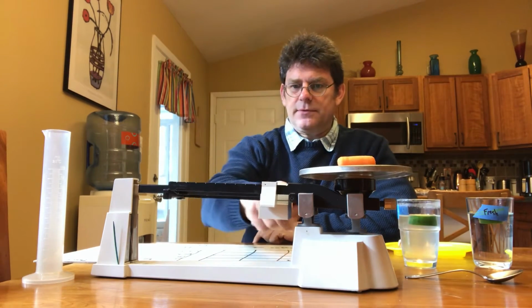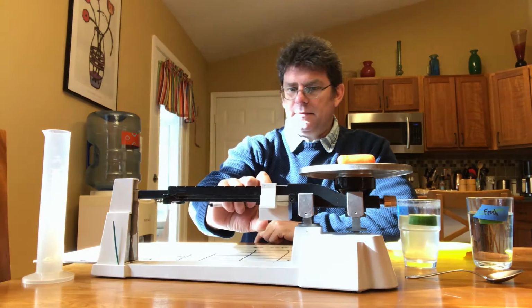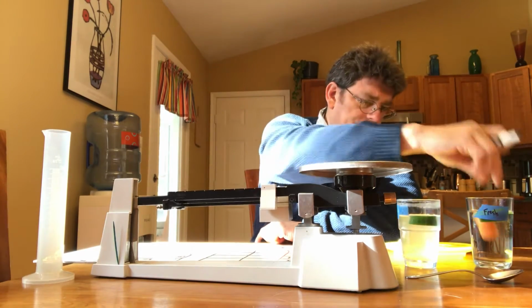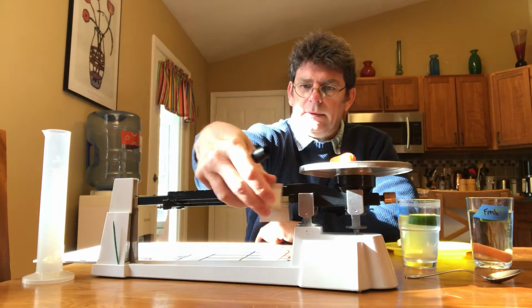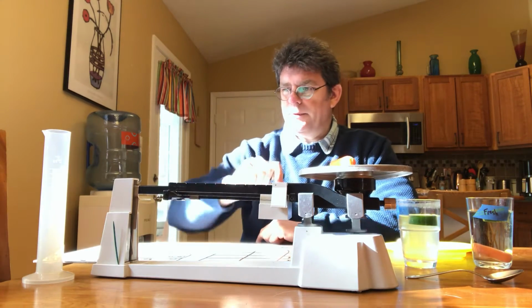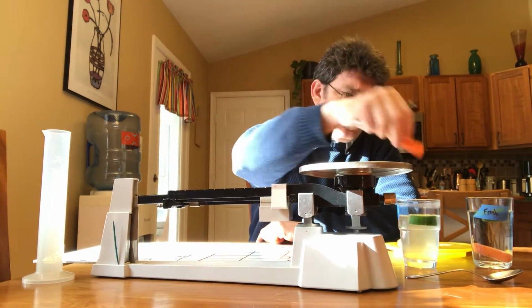All right, so let me do a carrot. And again, I know you can't actually see me doing the mass here. This carrot looks like 11.4. I'll put that in the fresh water. This carrot's a little smaller. Looks like it's going to be a little under 10 here. This carrot looks like 9.6 grams. I'm going to drop that in my salt.